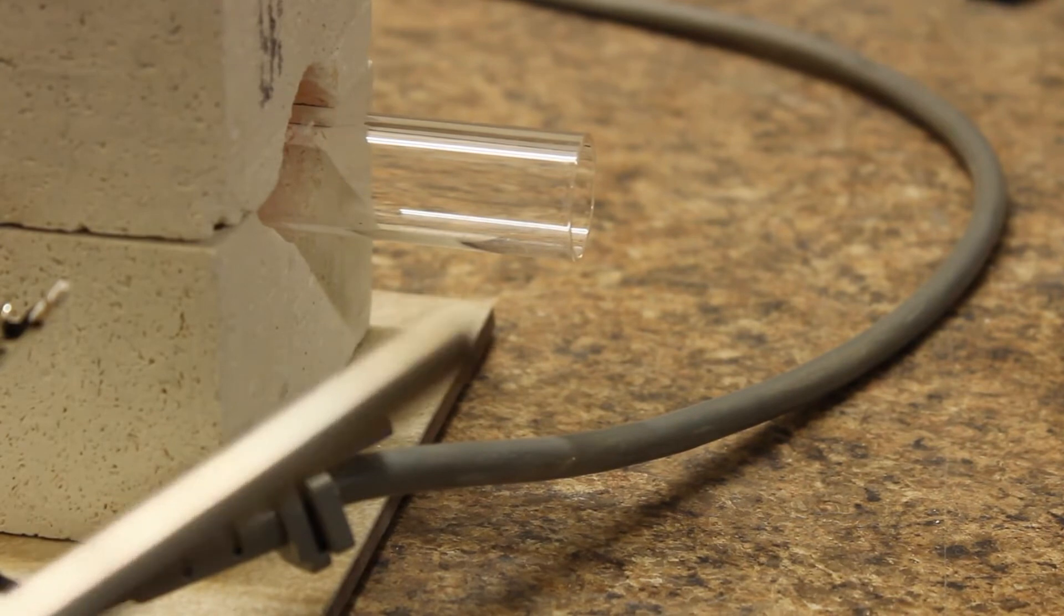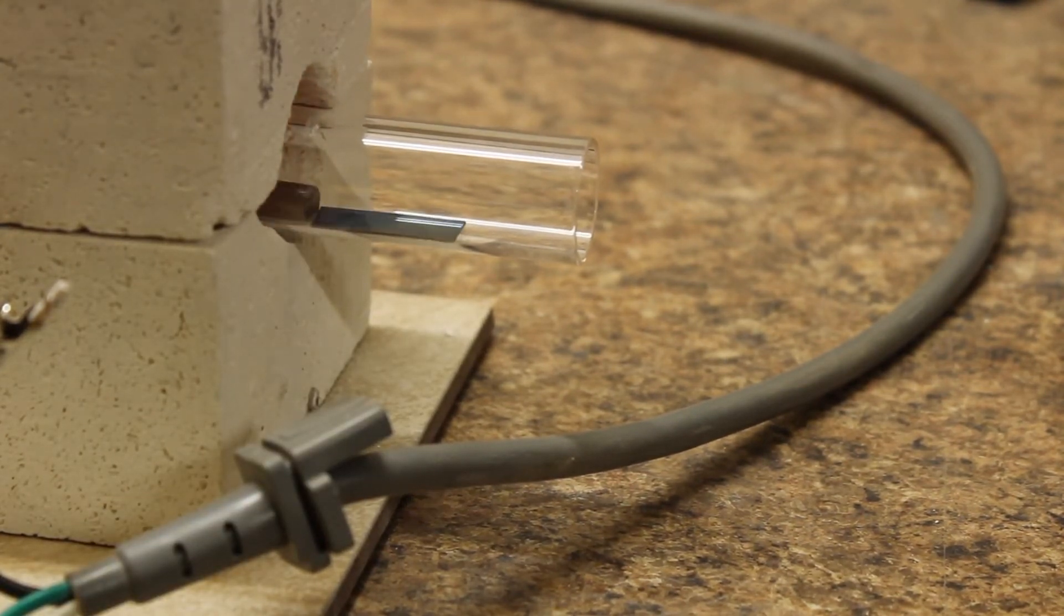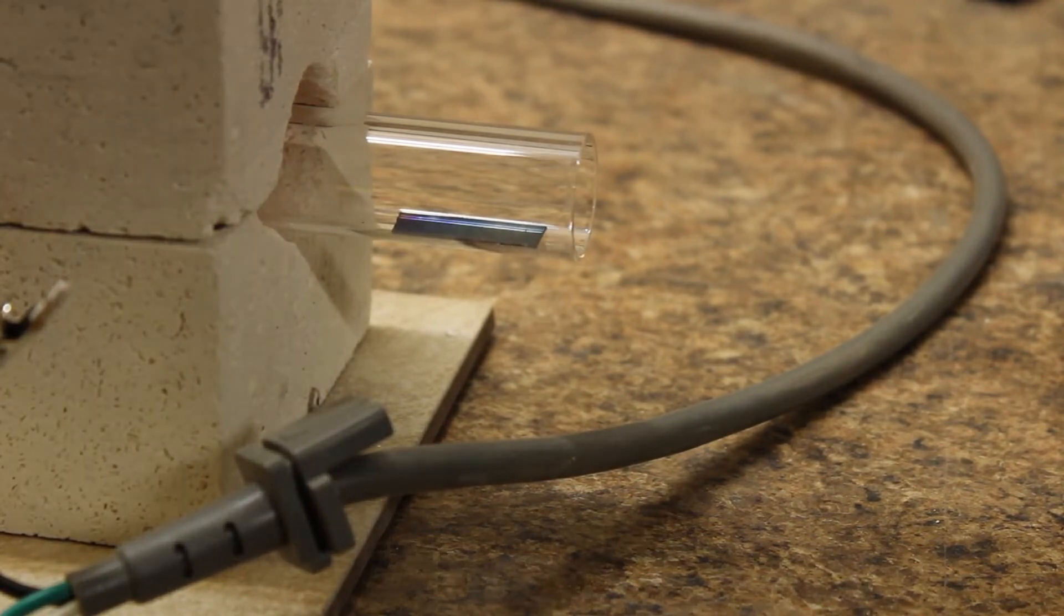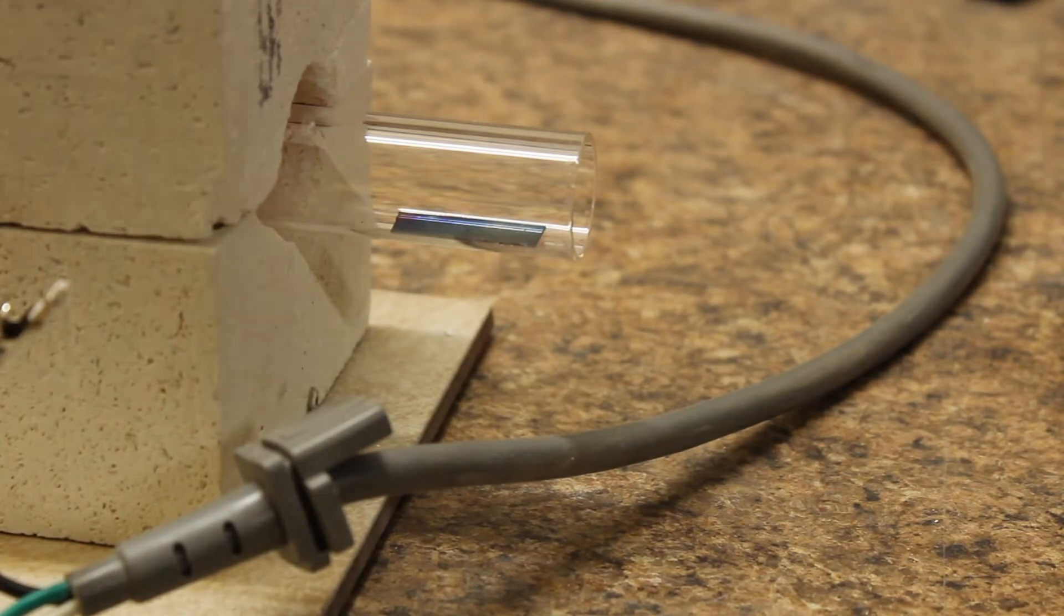Once an hour has passed we remove the connections to our steam generator and while the furnace is still hot we push out our substrate. The first thing we notice is that it's a beautiful blue color telling us that we at least did something. We let the substrate cool on the end of the quartz tube for 10 minutes then pull it out.